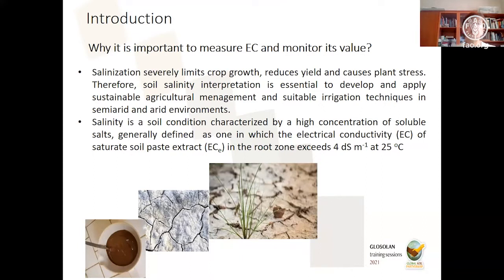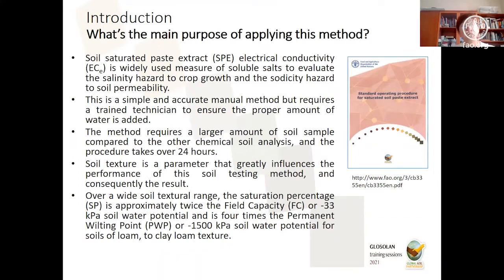And now, what's the main purpose of applying this method? I will repeat maybe some issues, but it is important to stress that soil saturated paste extract electrical conductivity value is a widely used measure of soluble salts to evaluate the salinity hazard to crop growth and the sodicity hazard to soil permeability. This is actually a simple and accurate manual method, but requires a trained technician to ensure the proper amount of water is added. The method requires a larger amount of soil sample compared to other chemical soil analyses, and the procedure takes over 24 hours. It's a pretty long time.